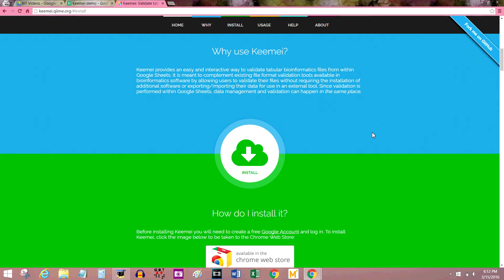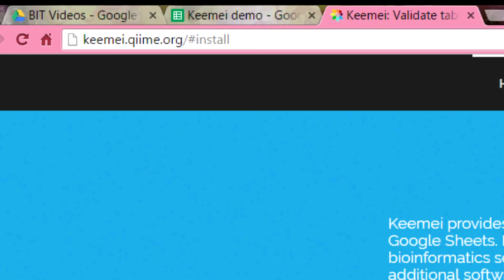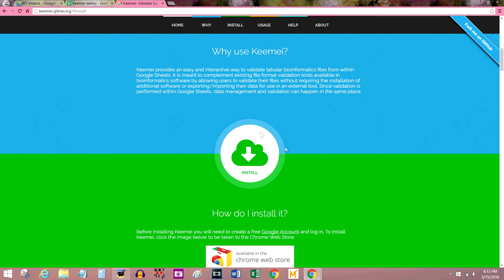If you want to follow along while I do this installation, go to keemei.qiime.org — neither of which are spelled the way they're pronounced. You can look on my screen here: k-e-e-m-e-i dot q-i-i-m-e dot org. And here in the installation section are some useful links for this tutorial video.